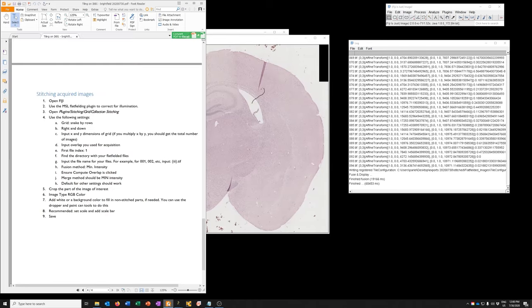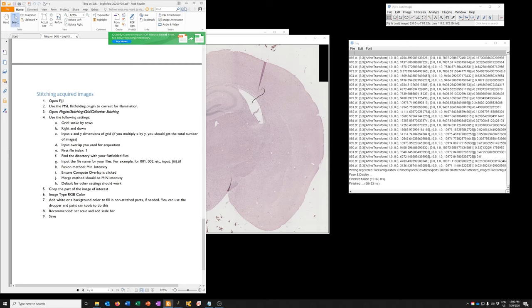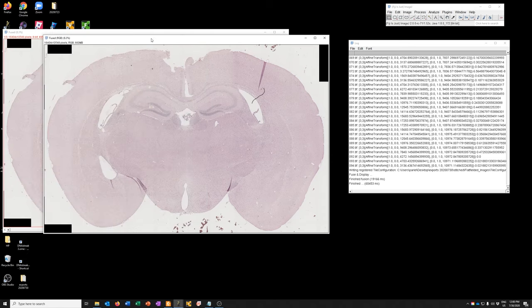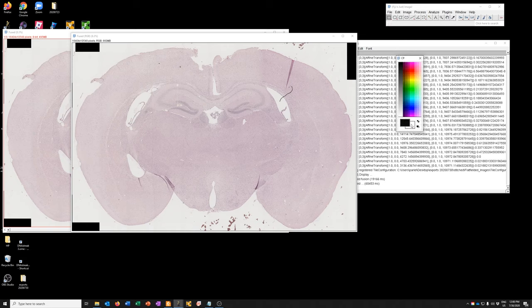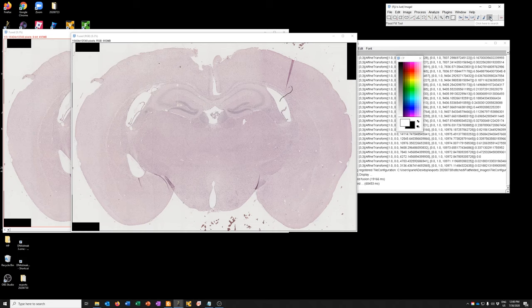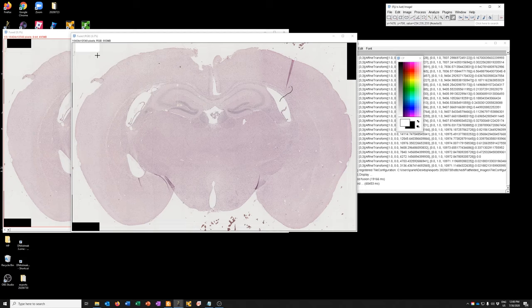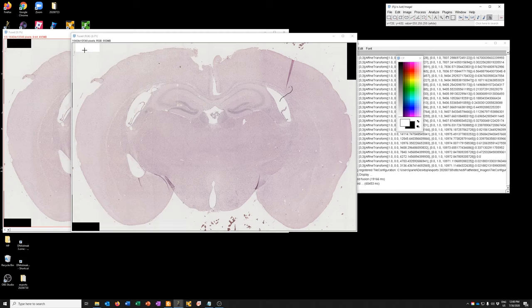The next step is to add white or a background color to fill in non-stitched parts if needed. You can use the dropper and paint can tools to do this. So what we can do is go here. If we double click this and we click this, these two colors become black and white. And if we click this arrow, the foreground color becomes white. So we can now use the paint can to fill this in with white. Now you can see that the white is very noticeable. So we want something that's more like this background. So to do that, we'll go to the dropper again and we'll just click somewhere like here.